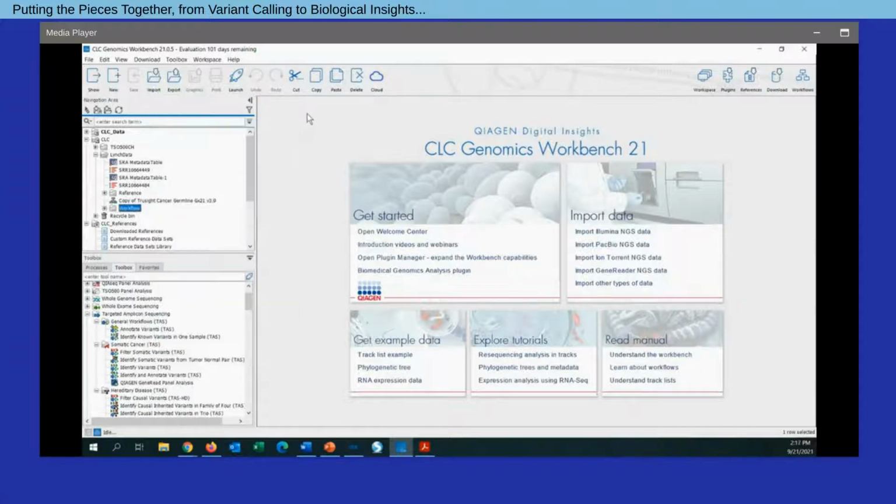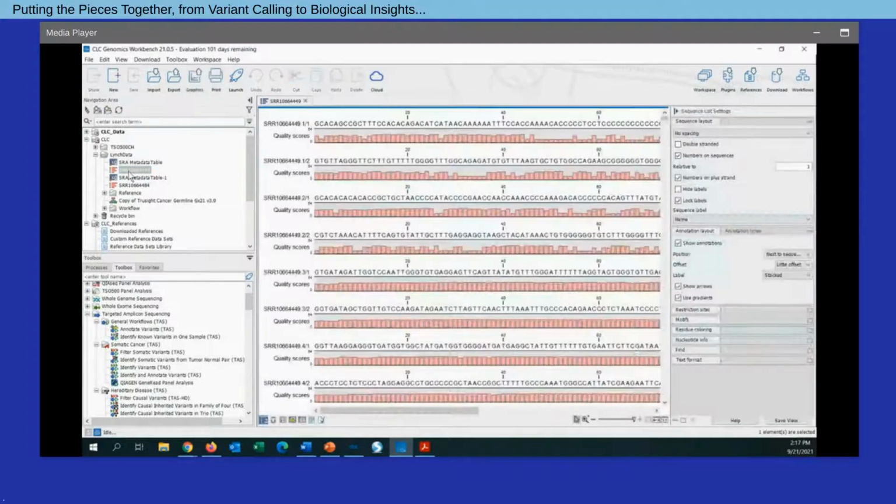Now, when we bring this information into the software, you'll notice to the upper left-hand side of the software, we have this navigation area. Essentially, this represents the directory structure within the software. And you'll note here in today's example, I have a folder created for Lynch syndrome data. And under that, one of the FASTQ files that I've downloaded from the Sequence Read Archive. And what I can do is I can open that file up. I can look at the FASTQ file. Again, lots of information here. So this is now a scenario where at this point we're ready to process the sample itself.